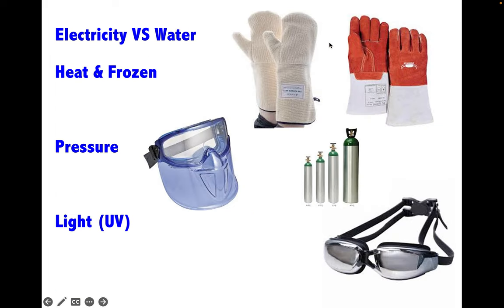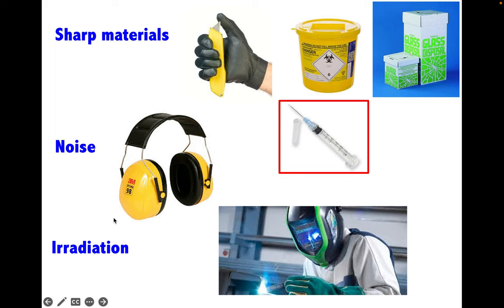To work safely, electricity must be kept away from water. Heat must be kept away from frozen equipment. Protection with appropriate PPE under these hazards is obligatory. For example, suitable gloves to handle hot and frozen items. Goggles, face shields, and spectacles must be worn against pressure and UV light. Sharp materials must be correctly handled or disposed of — do not recap uncapped needles. To protect your ears during sonication, ear plugs or ear muffs must be worn. When working under irradiation, suitable protection must be used.